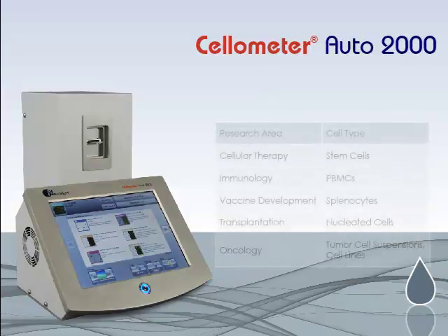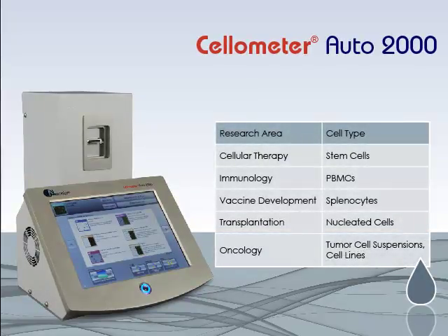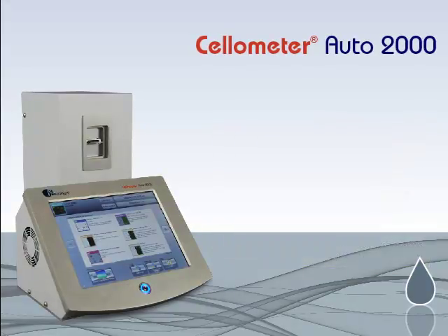The Cellometer Auto2000 is the instrument of choice for researchers in a wide range of fields performing primary cell analysis, including cellular therapy, immunology, vaccine development, transplantation, and oncology. Contact Nexcelom today to request an Auto2000 brochure or schedule a free in-lab demonstration.